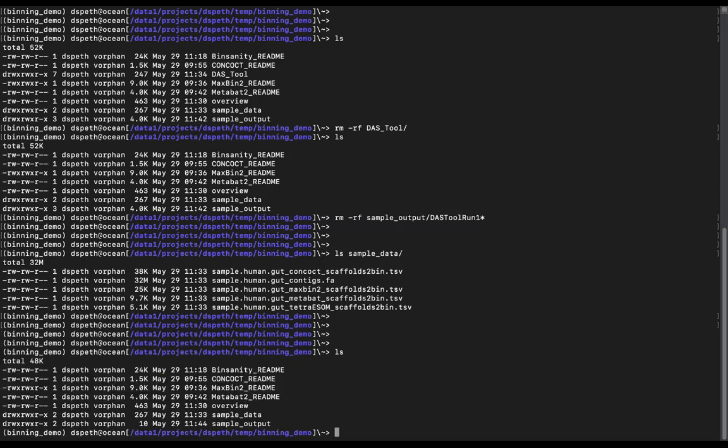Cool. So the way we would practically approach this problem of binning is, if we had one organism that we were interested in a sample, we would probably go and attempt to pick that out using manual binning, because it gives you the best handle on what a single organism could do.